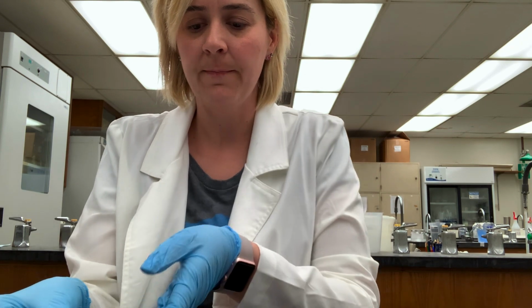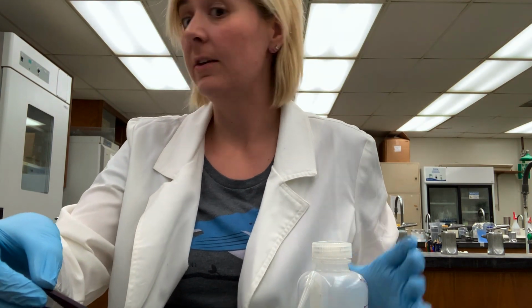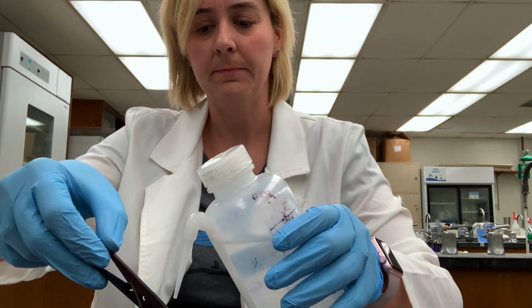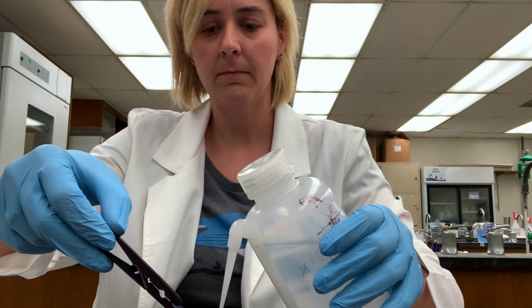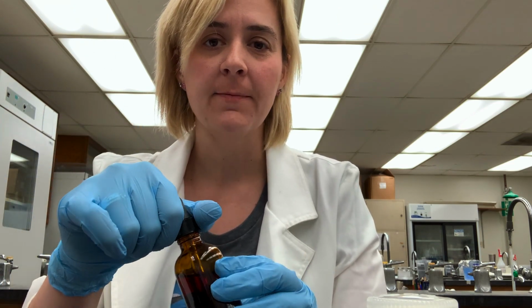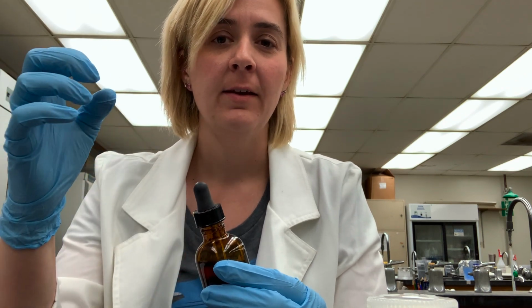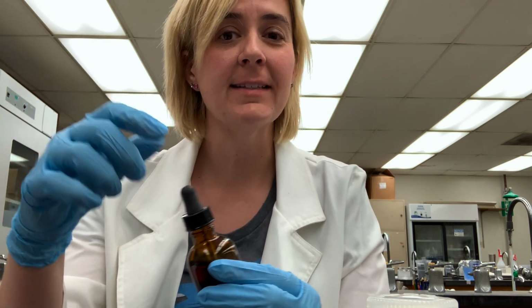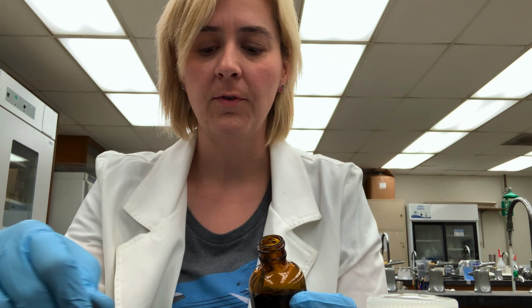Okay, so it has been 1 minute. What we'll do now is pick up the slide and rinse off all of that Crystal Violet using some water. The next step in the Gram stain is to cover the slide with iodine. Iodine serves as what we call a mordant, and what iodine is going to do is bind to the Crystal Violet and form this big complex that'll kind of get stuck inside the peptidoglycan. So we'll let the iodine sit on the slide for a minute.